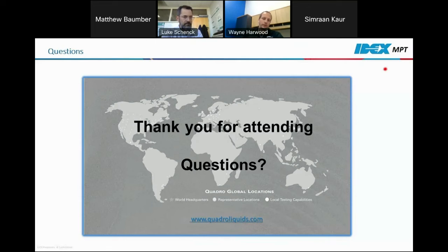Thank you, Oleg. With the HV0, the maximum tip speed is also 70 meters per second. That's consistent across the board for the 0, the 1, and the 3. That is the maximum tip speed. Obviously, we run at a different rotational speed on each of the units to achieve that tip speed.